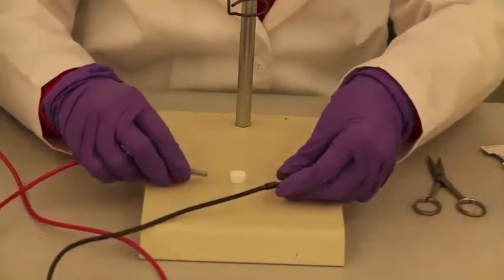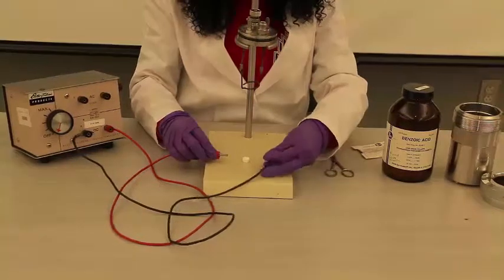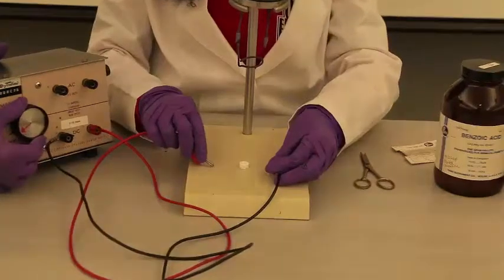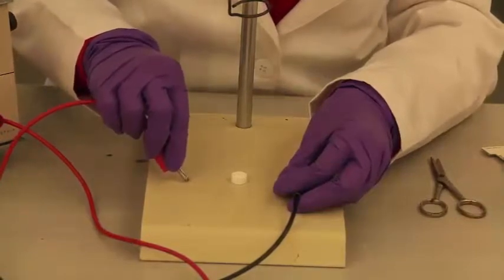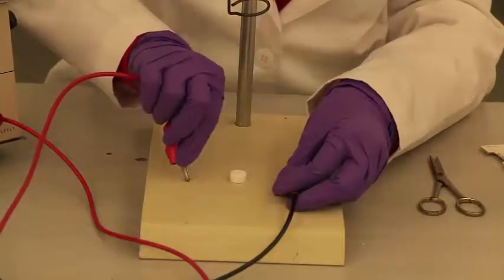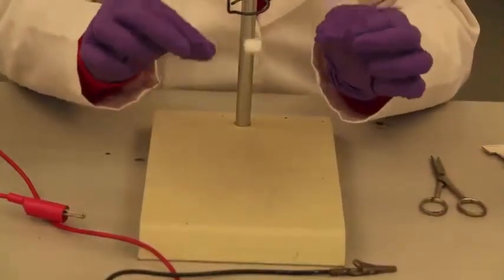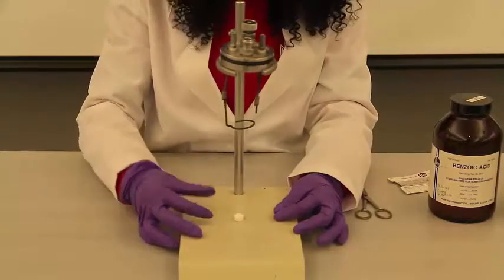Stretch the wire across the top of the sample and have your lab partner turn up the current until the wire fuses. You will see the wire start to melt into the sample. Once done, turn off the current. Give a small shake to assure the sample is securely fused. Now weigh your combined sample and wire and record this weight.